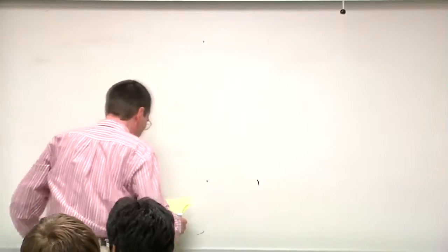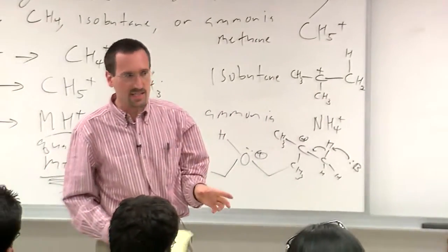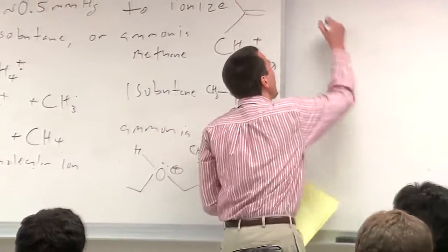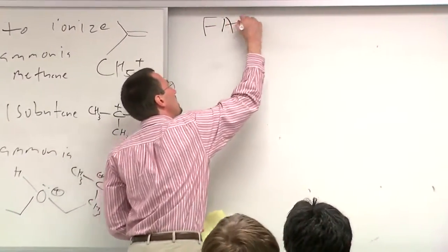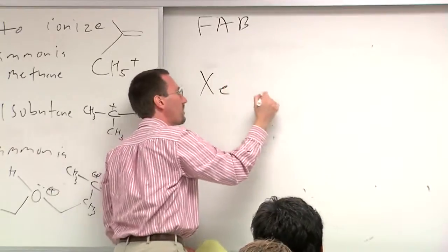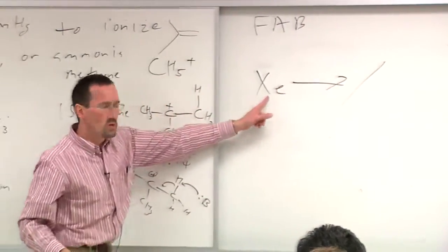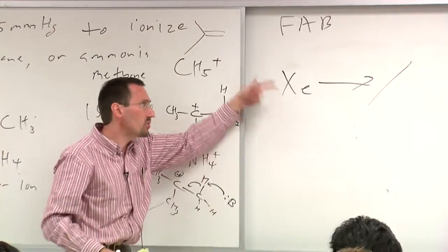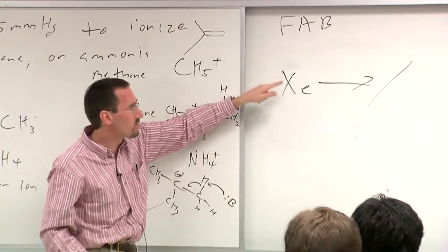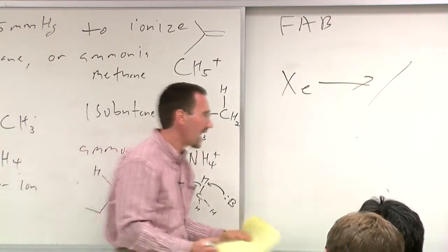Soft ionization techniques, in which the ionization process gets the molecule into the gas phase, solve this. Fast atom bombardment was, I think, the first one developed. In that case, you take an atom that's moving quickly, and you do that by an electrical process to ionize, accelerate, and then reneutralize that atom.